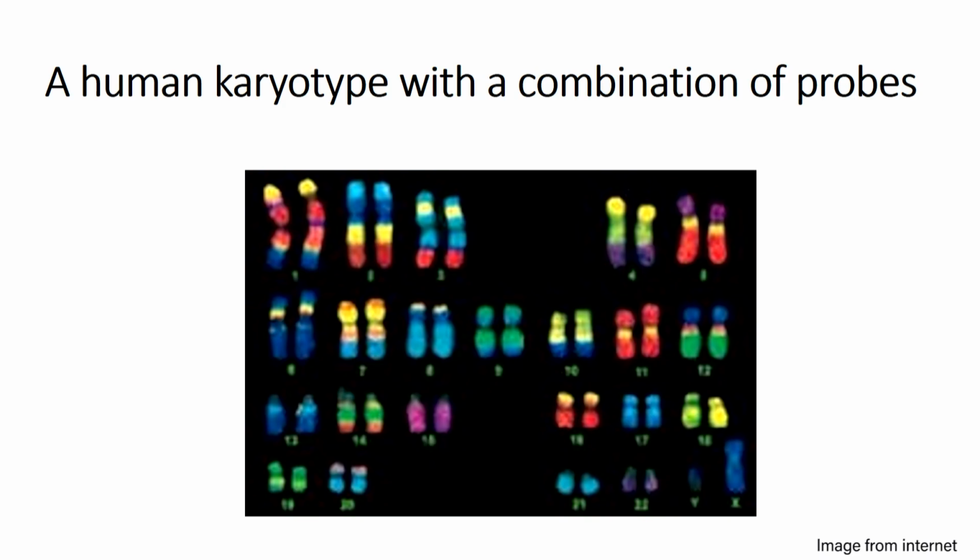For single gene identification, this is very much possible. For 2 gene identification, this is very much possible. But for karyotyping, I will say that we should go back to G banding only, or G banding, Q banding, those kinds of classical bandings for identifying the different chromosomes and different chromosome regions.